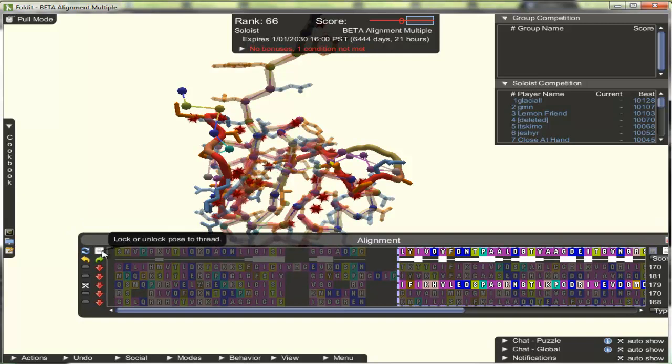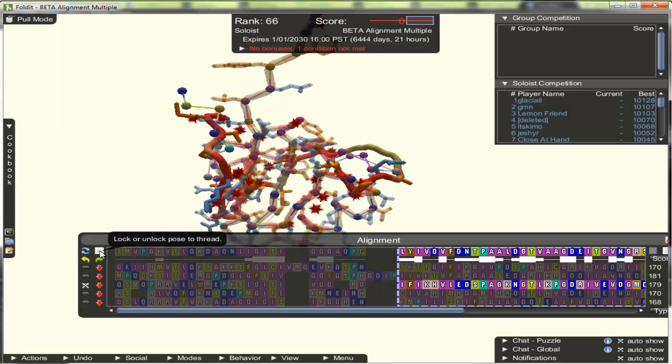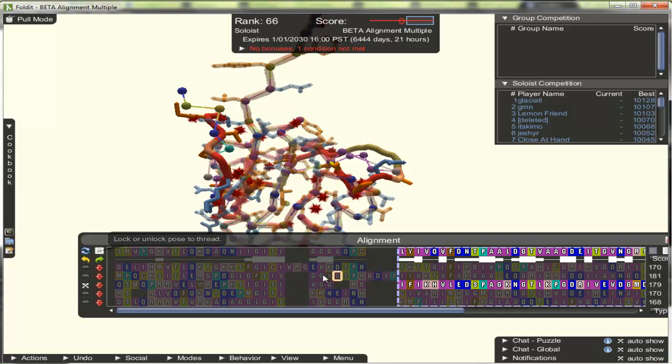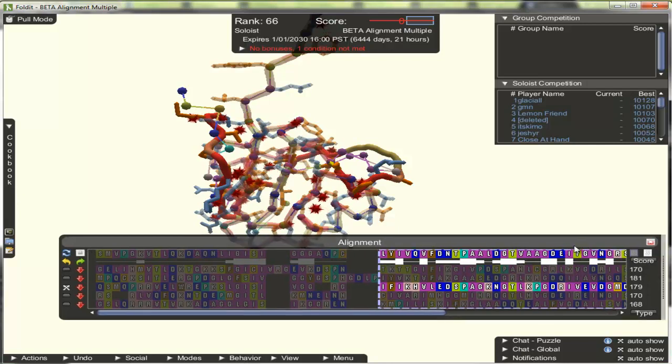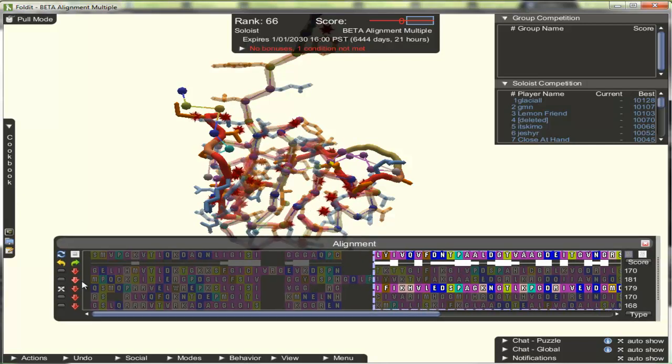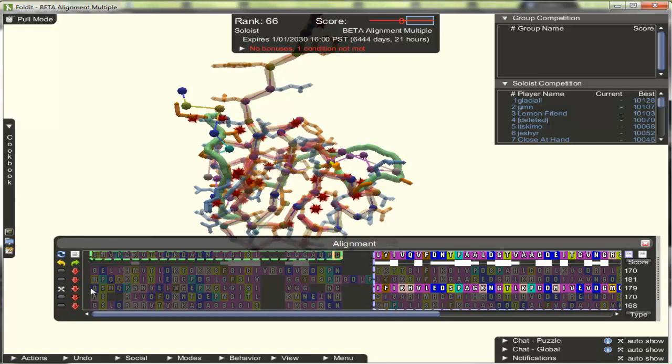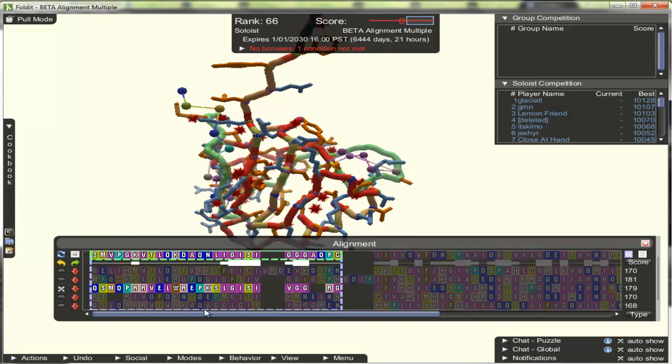Now if we want to partially thread another region of the protein separately to a different template, we can first disable locking to the thread, and we can select the other region and mark that to partially thread.